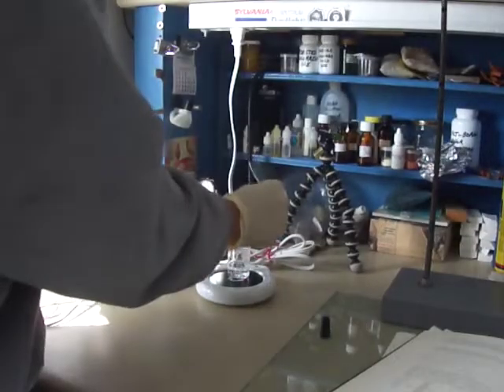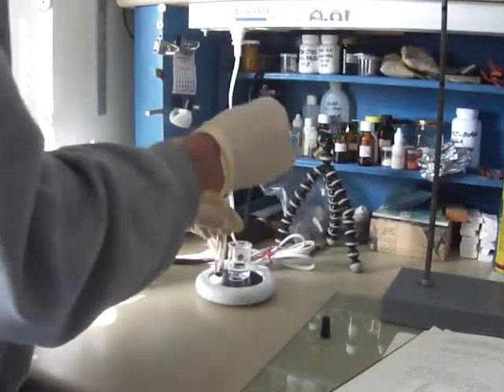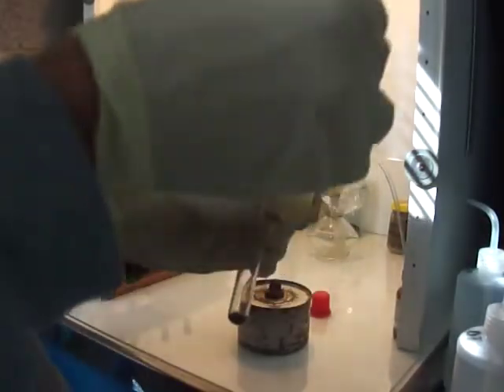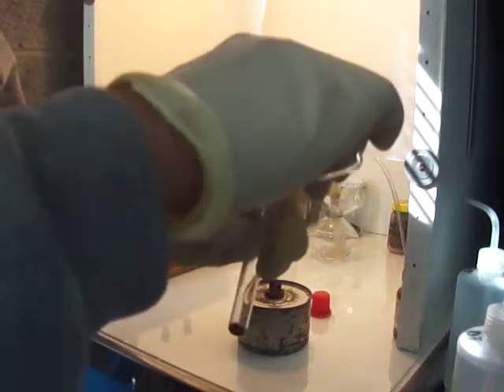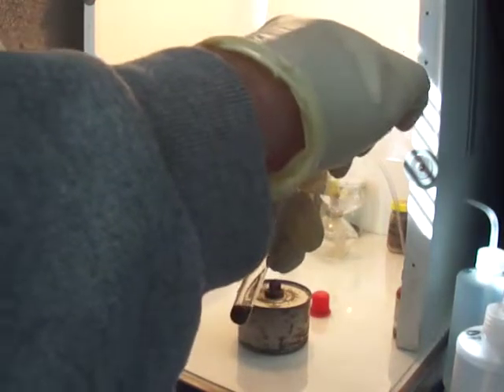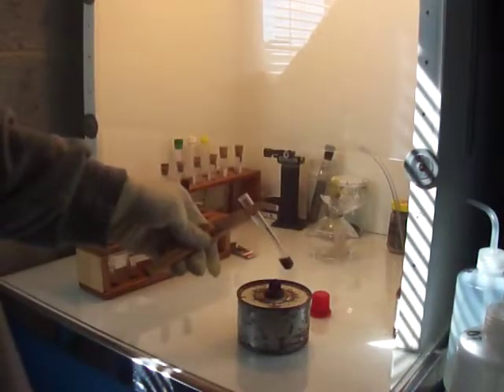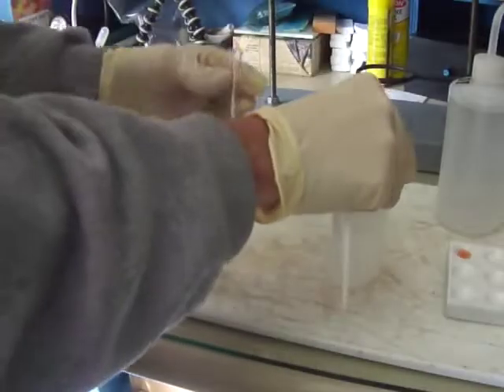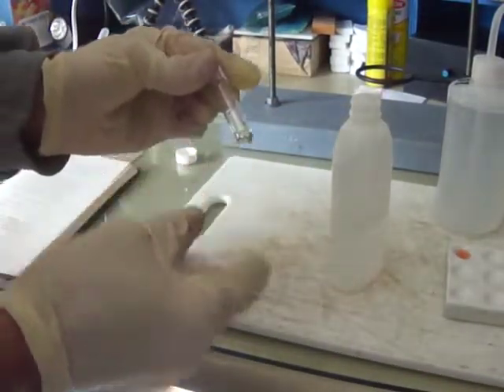Now we wash the precipitate 3 times with hot water. And now to our washed precipitate, we add 2 mils of 2 molar sulfuric acid. We boil that for 1 minute. Now we add a couple drops of hydrogen peroxide and boil until dissolved for another minute. Now for the nickel test, we take a little bit of the solution and we need to make it basic again.